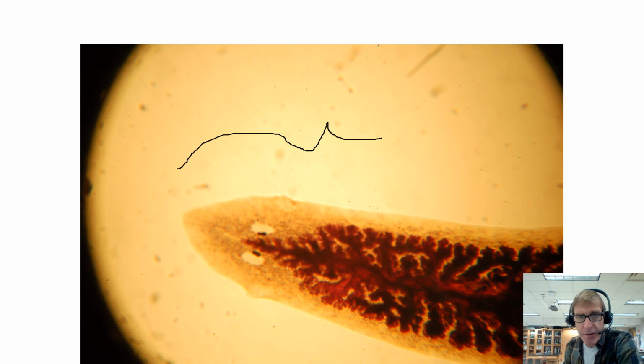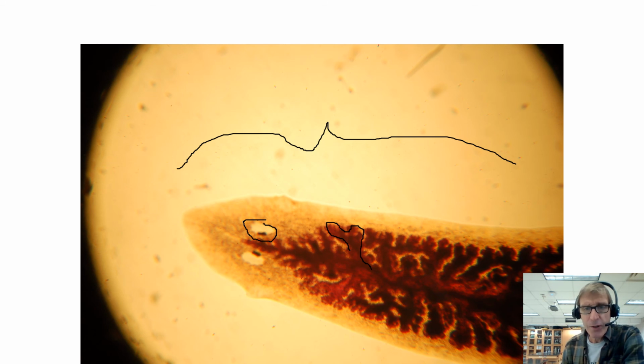This is the anterior end of the phylum Platyhelminthes. Those are the flatworms. These have a solid body, no coelom at all, and all you can see on this slide is kind of the anterior half. You've got some eye spots here, mainly for detecting light and dark. They don't form any images. And this is their very branching gastrovascular cavity. All of this is dark stuff. They've just injected the gastrovascular cavity so you can see it. Class is Turbellaria. These are free-living flatworms.